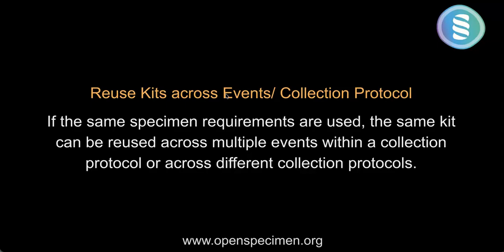So in such cases, the same kit structure can be used across the events. In this scenario, the users will not have to sort the kit based on the events or collection protocol. They can just pick out the kit for the event for the participant that walks in and use the kit for that particular participant visit.